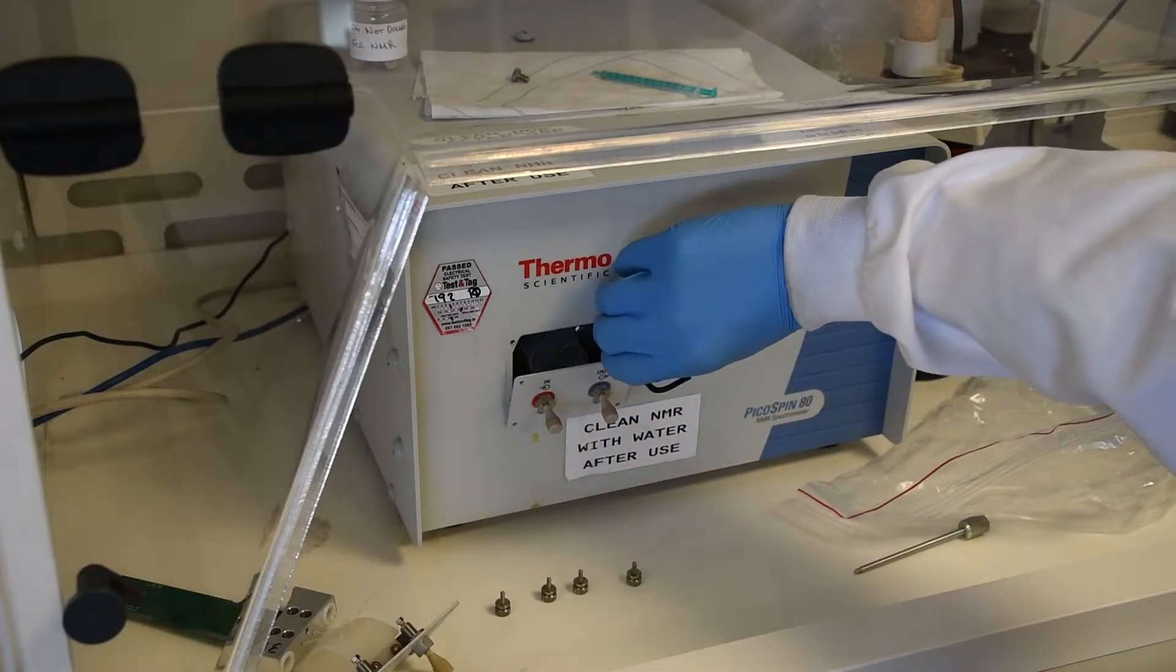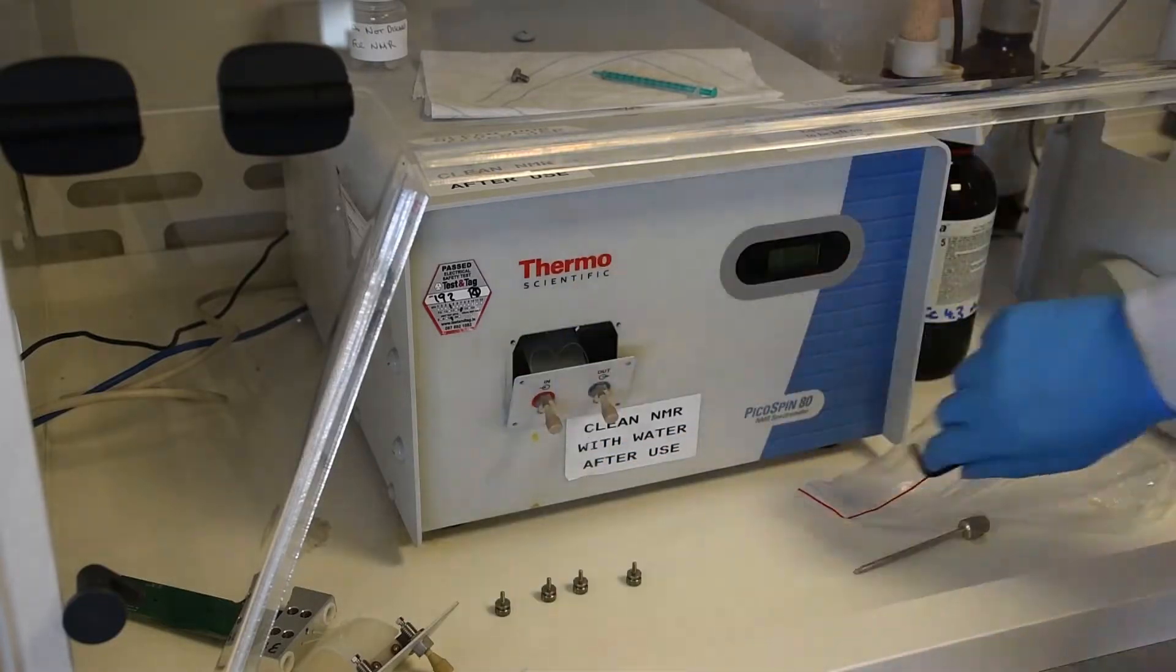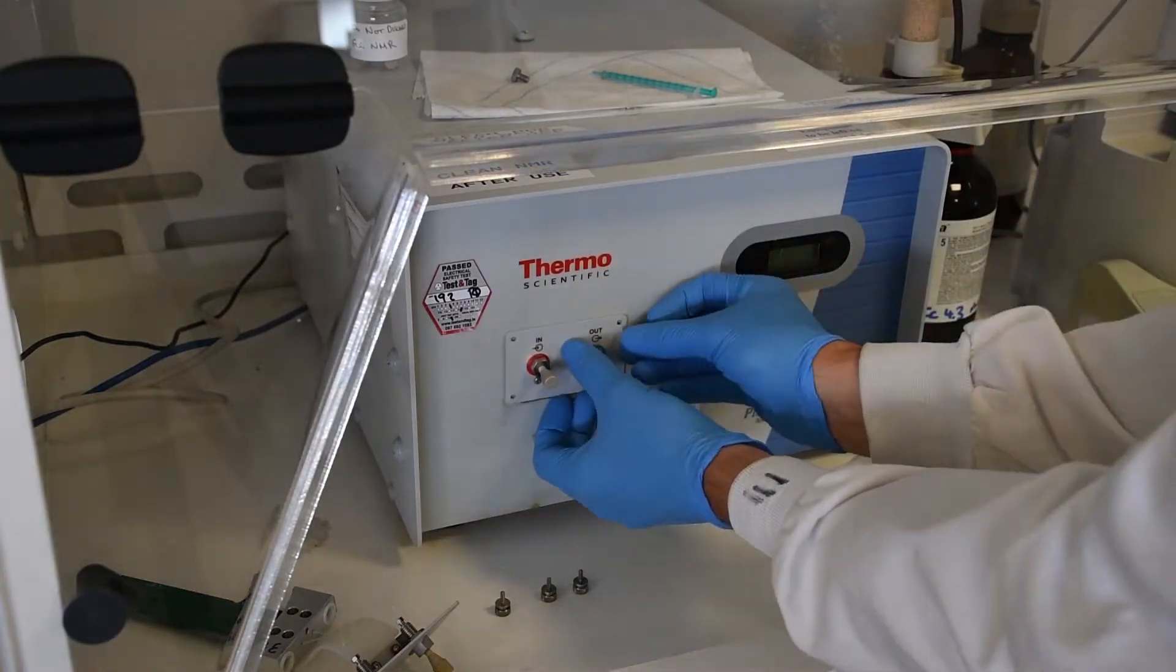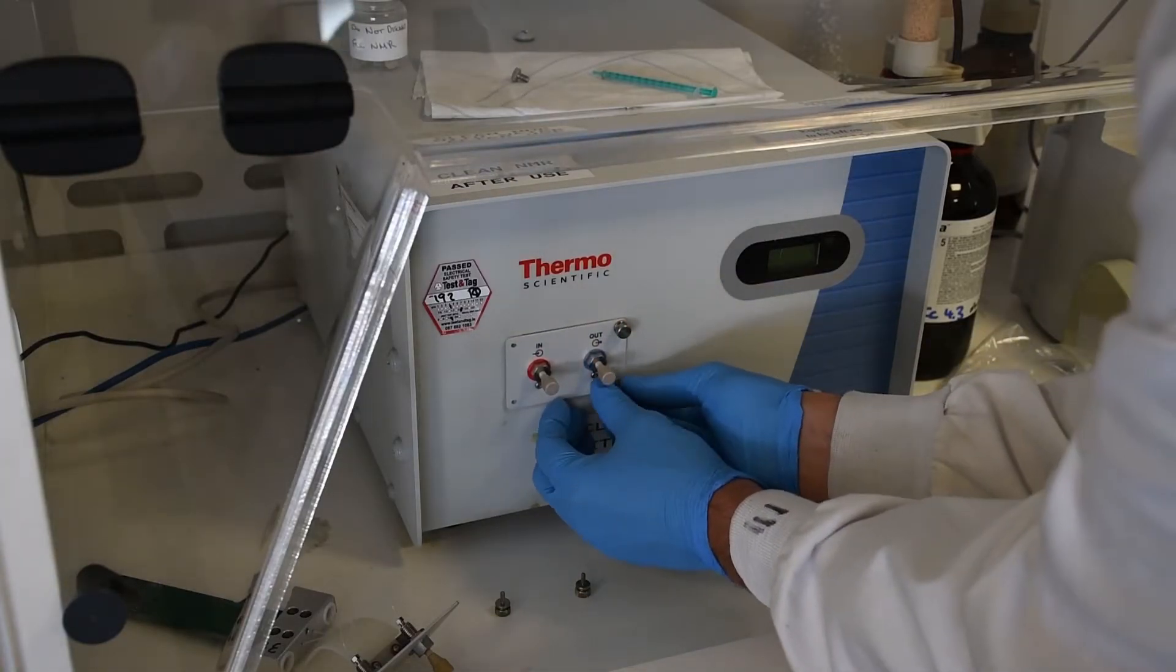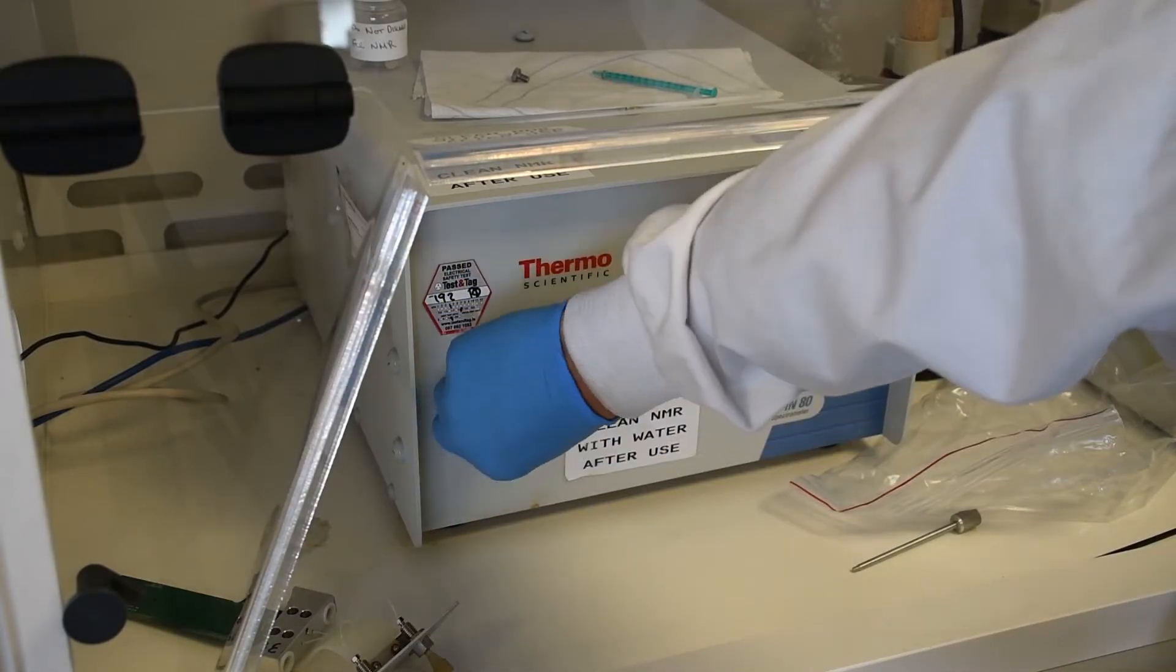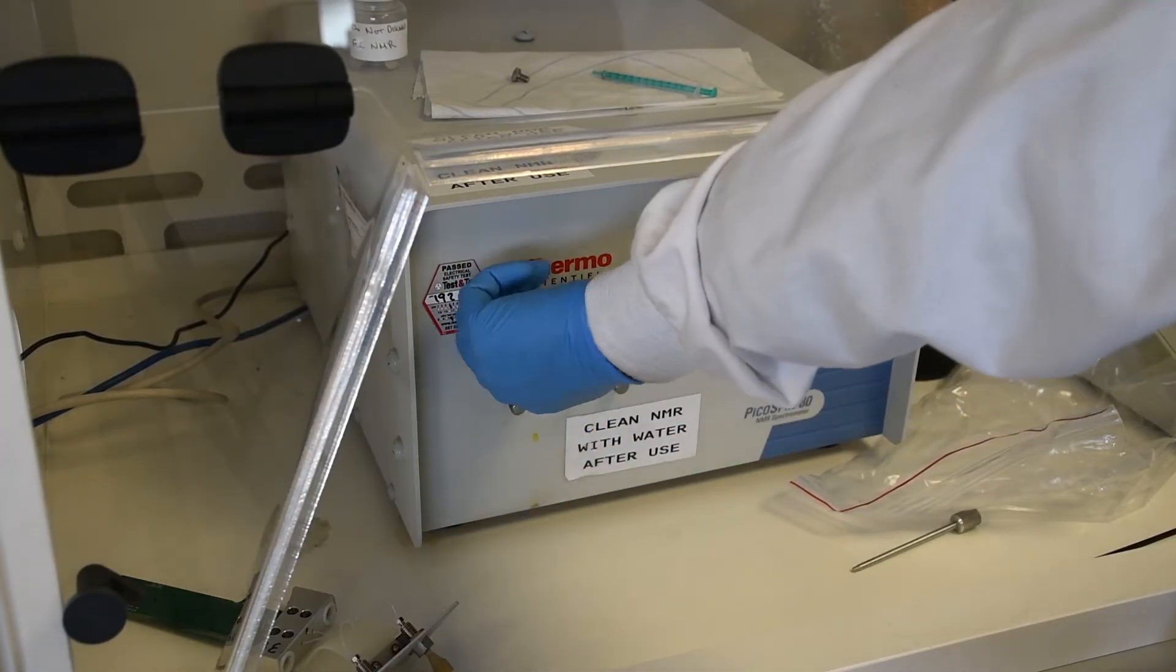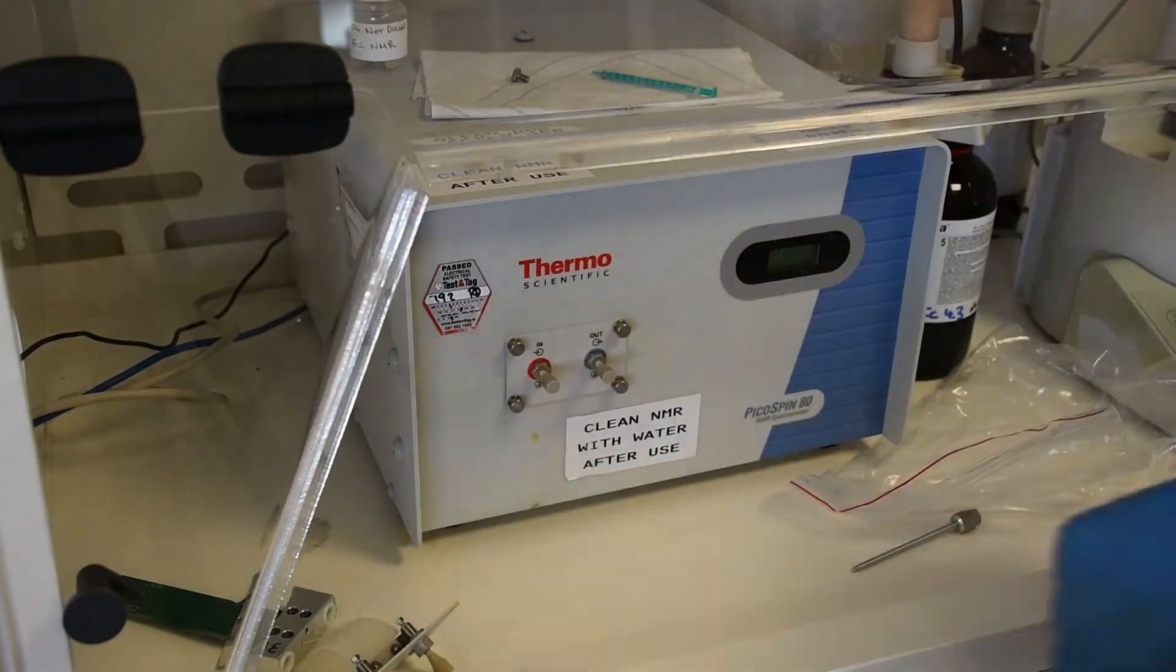Once you are done with that, put the faceplate back on and put in the four finger screws and then you are finished. Again when you are putting the finger screws in, just be a little bit careful not to cross the threads. You can see I put them in not too tight on all four positions and then I follow them around tightening the opposite ones just to make sure that it is nice and not too stressed out, nice and evenly balanced. That is all, thanks for listening.